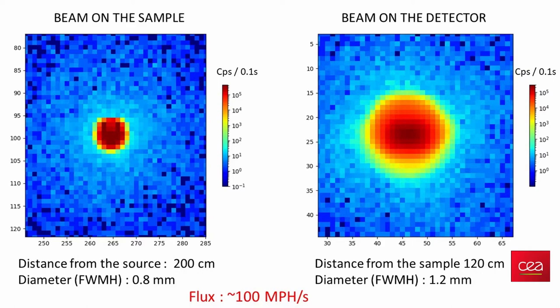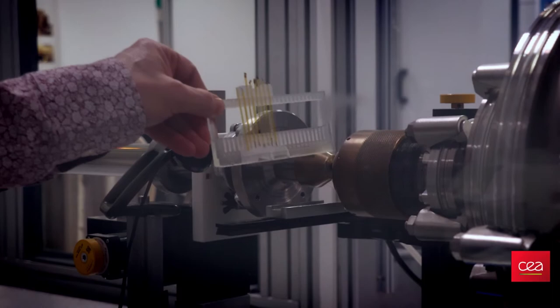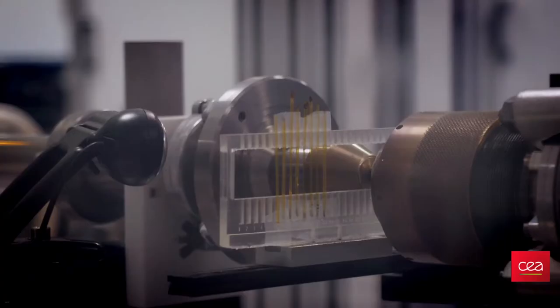0.3 angstrom^-1. The last slits are a homemade design, and we patented this system with my colleague Olivier SPALLA. It is composed of a small anti-scattering aperture and defines the beam just before the sample.